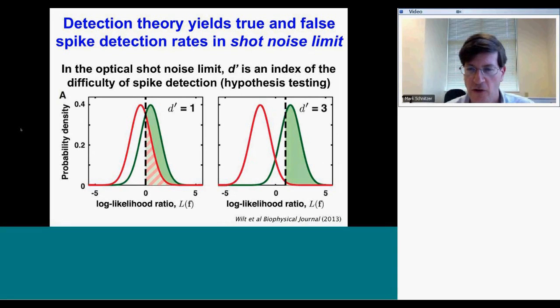Now, when we see these observations of photons, we don't know the underlying ground truth, but if we run this experiment again and again, we can form the probability distributions that we will see assemblies of photons that are detected that are characteristic of an activated cell versus an unactivated cell. So the difference between the log likelihood ratios in the case when there actually was a spike and when there was not a spike tells us the difficulty of the discrimination problem that we face.